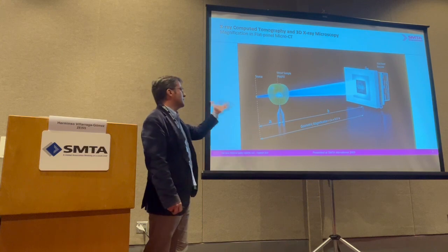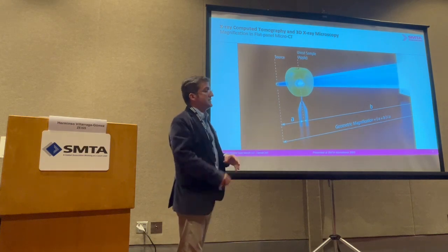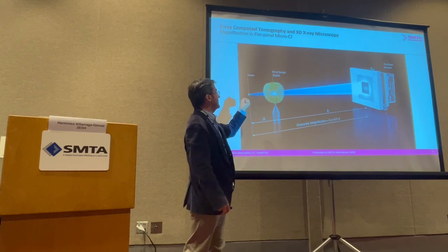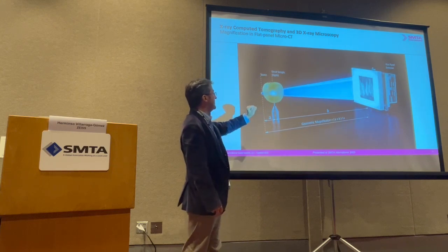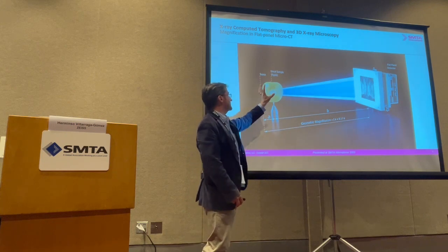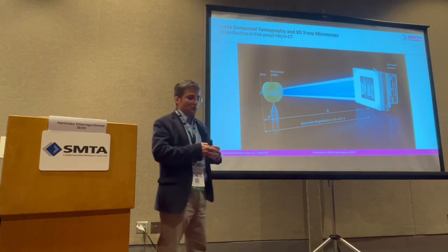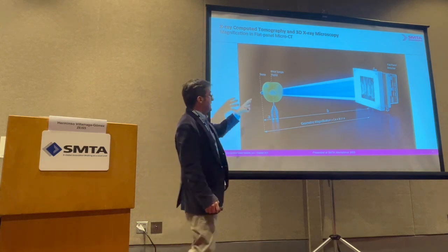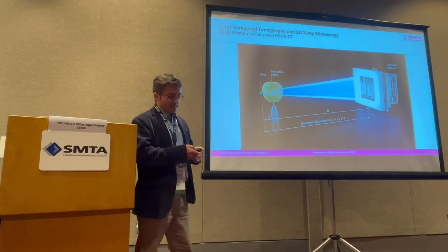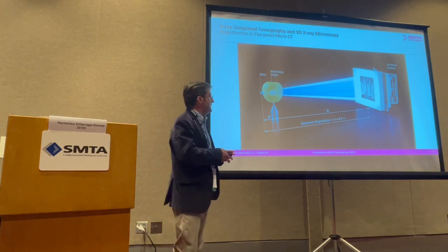And a little bit of a fancier video is an explanation here with an apple, but you can imagine you have one of your devices, an electronic component, and it shows what happens when you try to get the highest magnification in traditional computer tomography. Yes, it's possible until you are out of room here because the sample needs to rotate. So the only way to get higher resolution in this case would be to actually cut the sample. And even if you do that, because you're only using geometrical magnification, those resolutions are going to be limited to something in the order of 5 or 10 microns, depending on the chunk that you cut of the part.